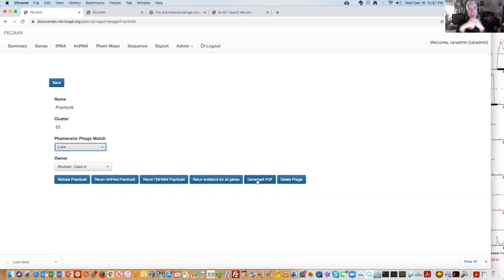And so I found that if I switched to using the GeneMark for Mycobacterium TB, it gave me a much better prediction for the trace. So after working with it, you can come in and put in a better one if you find a better trace, for example.